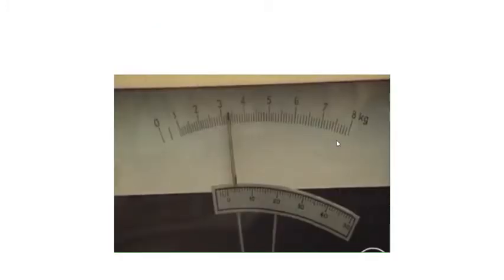This is the load scale in the instrument and this is the elongation scale. The load scale pointer is here, the elongation scale pointer is here. Here the elongation scale moves and the pointer is attached to this load scale so that the exact elongation is measured. The elongation scale moves, the load pointer moves. The load scale remains constant, whereas this pointer and the elongation scale both move to record the exact elongation in the specimen.